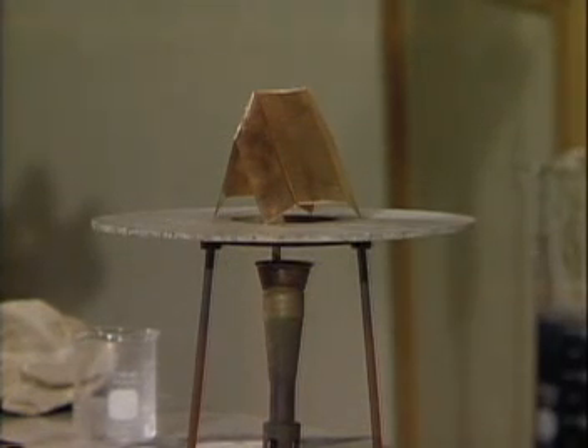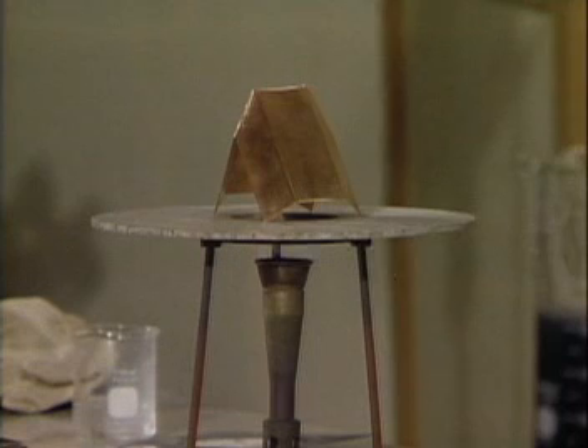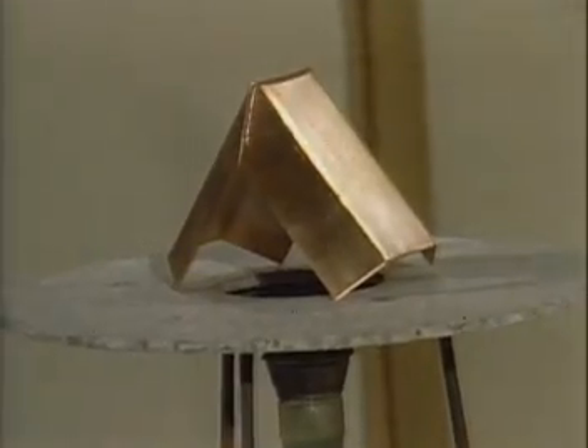Now, we learned that when we burn something it combines with oxygen. The combination with oxygen is the burning reaction that we talked about, the combustion reaction, and we're going to heat this very, very strongly. I want you to watch and see if you can make any observations about the copper piece that we have here.